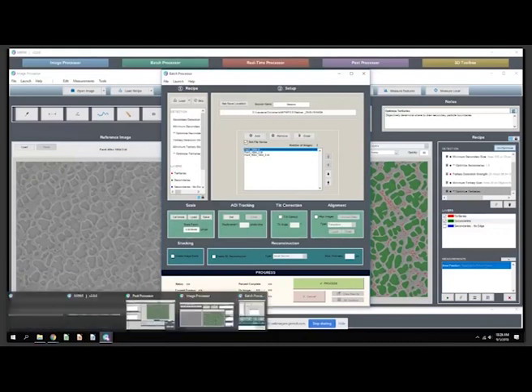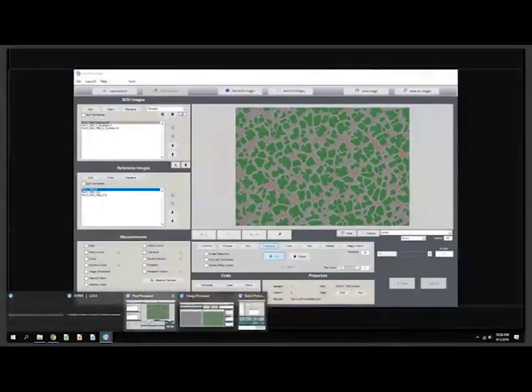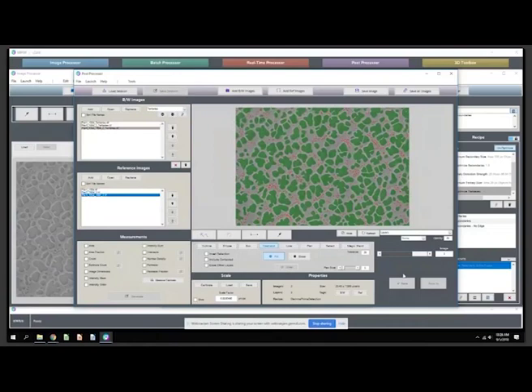And in the interest of time, I've already got the post-processor environment up. Once this was done, you would hit view results and it would open the batch in the review environment. So in here with a slider, you can flip through all images that were part of your batch and evaluate how the algorithm worked. You've got manual editing, Photoshop type tools down here to correct any mistakes quickly, save and move on to the next. So it's a very accelerated supervision environment.